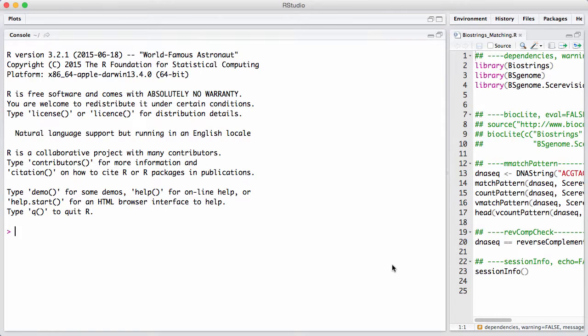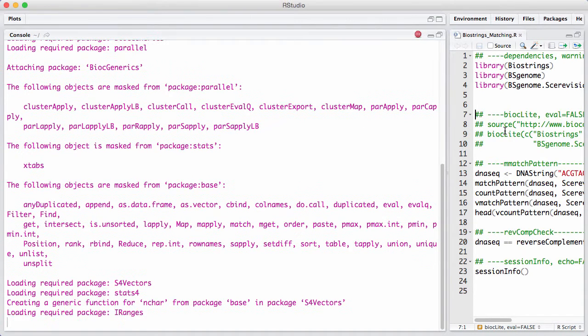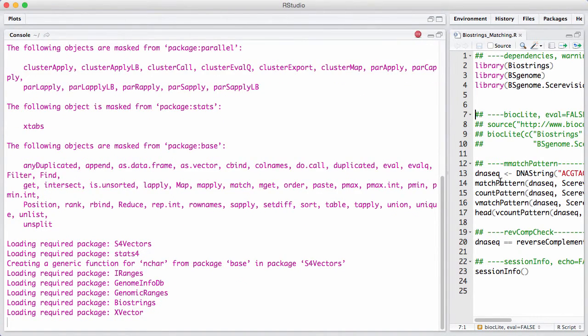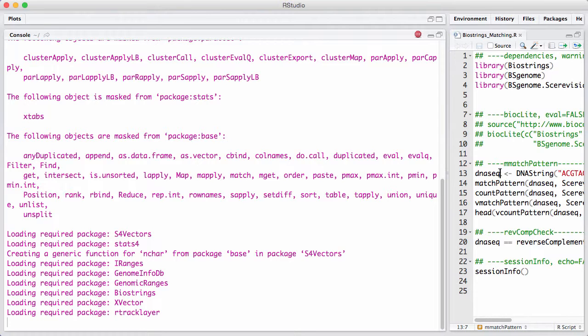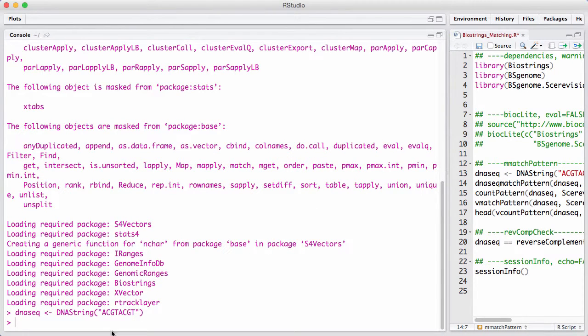So let's start off by getting a genome and a string. I'm going to load the yeast genome version 2, and I'm going to have a small little DNA string here that we're going to print on the screen.